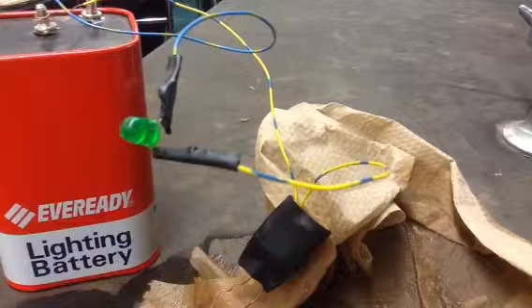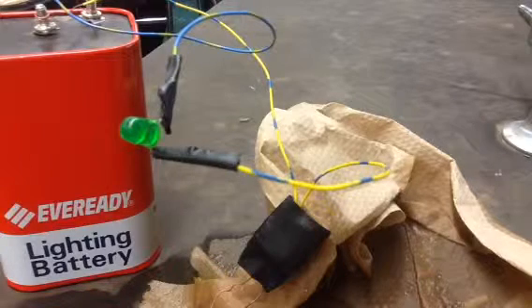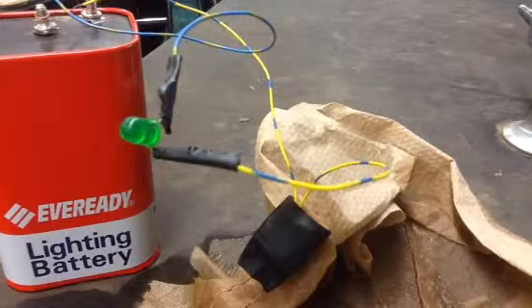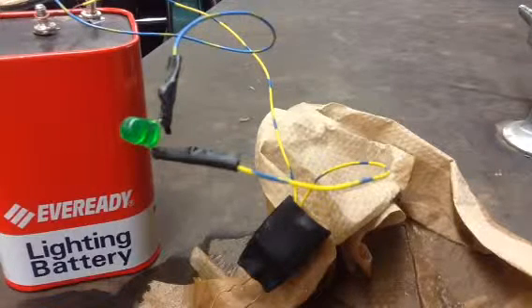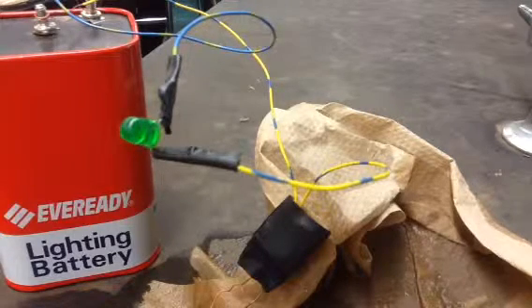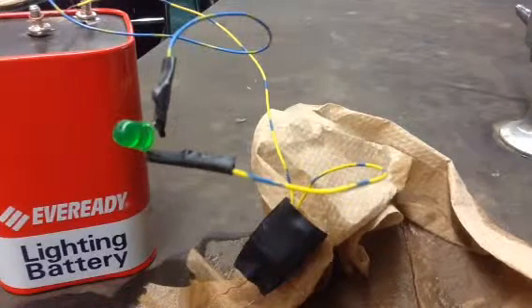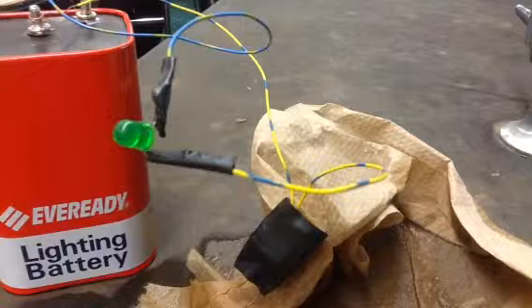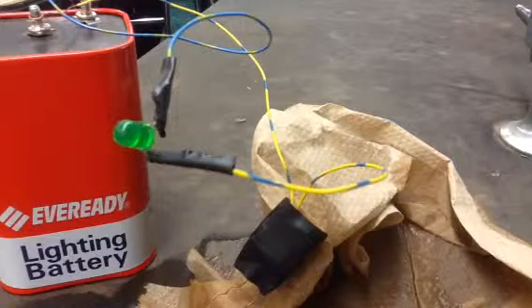Pure water, would it surprise you to know, is not conductive at all. If you want to go out and swim in a lake of distilled water in a lightning storm and shake your fist at the sky, go for it. Distilled water is not conductive. However, particular solutions of water tend to be conductive. Lakes and rivers and puddles are great conductors of electricity because no lake on the planet is pure water. They got all kinds of stuff in them. So based on the results that we've seen here, you might begin to make some generalizations about what kind of solutions are conductive.